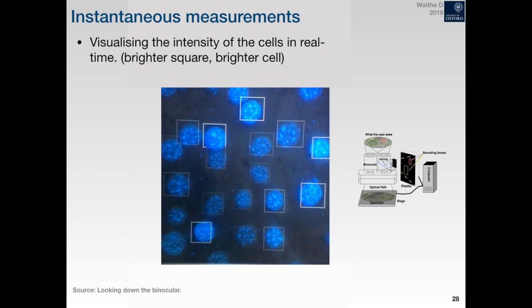For the remainder of my fellowship and my next grant, I want to build a whole suite of real-time analysis so that you can be informed about what's going on in your microscope just as you're looking around your sample. So not just for automation, but also just for, oh, I want to know how many foci there are approximately and things like that. I don't want this to enhance people's bias, so it has to be connected to the automation, but we really want to have real-time feedback.